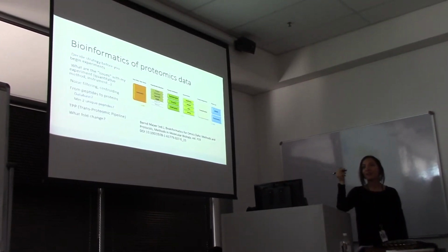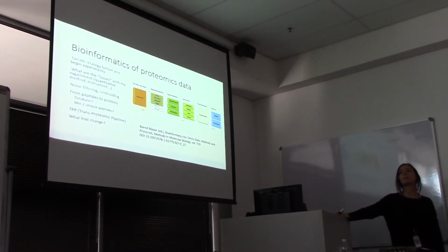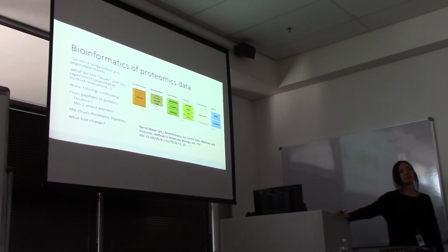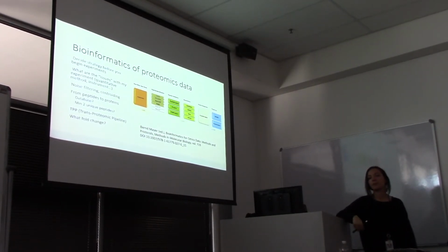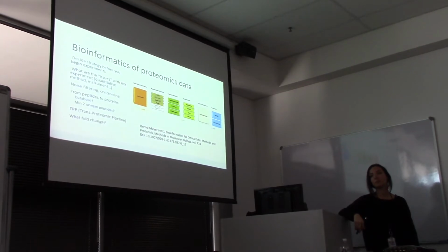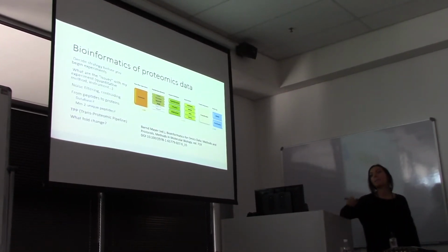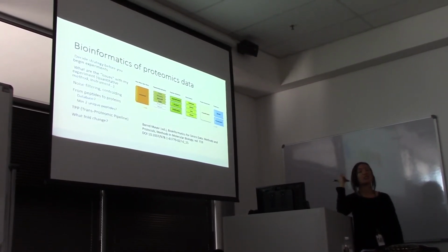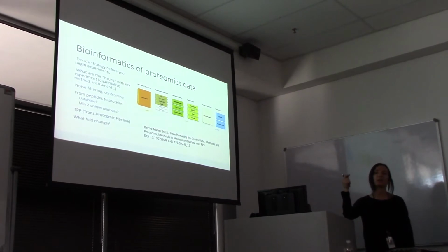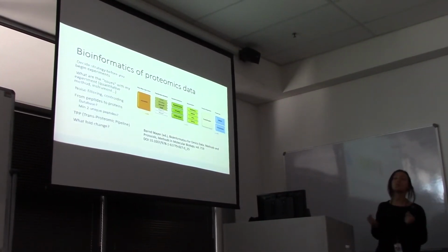Ashwell, maybe you want to tell us what you guys do? We stick to 2 and 3. 3 maximum, 2 minimum. Yeah, we go 2 minimum, but yeah, 3. That's the standard, yeah. But it is this question of are we omitting things that are maybe interesting? But how statistically valid are they? Yeah. So it's a tricky question, and I think we have to stick with maybe the norms, but think about perhaps you're omitting things that could be interesting.